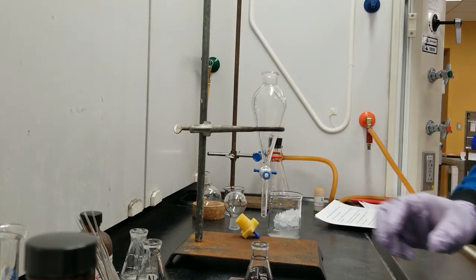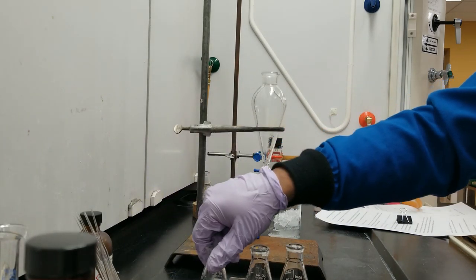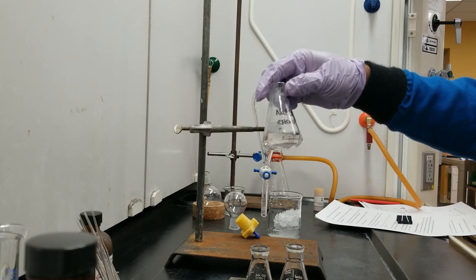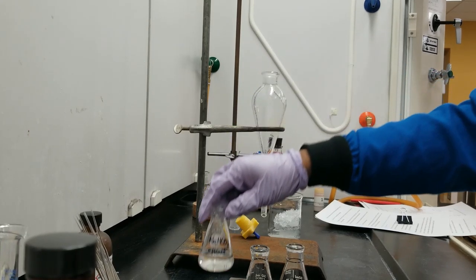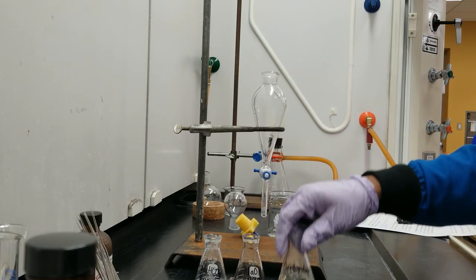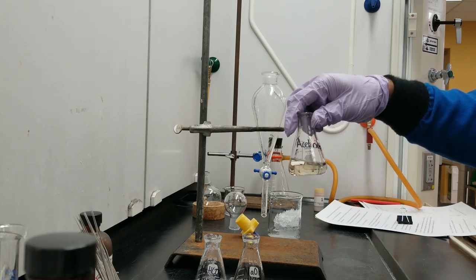Now we have separated three parts of our solids into three different solutions. The first part is sodium bicarbonate extract, which contains the 3-chlorobenzoic acid. The second one is NaOH extract, which contains 2-naphthol, and this Erlenmeyer flask contains acetanilide in ether.